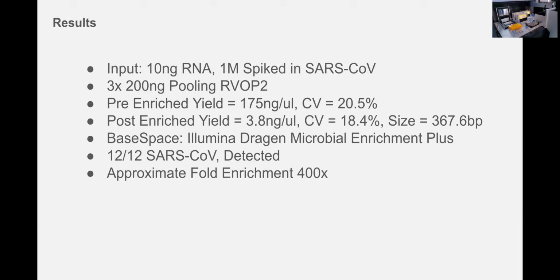So this is all experiment dependent. Once you set up the protocol, you could simply use the runtime parameters to adjust the amount of PCR cycles depending on what your input is, depending on how much extra sample you need if you plan to do multiple enrichment captures. All this is easily changeable within the protocol itself.